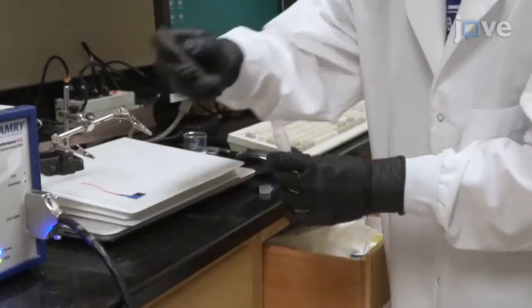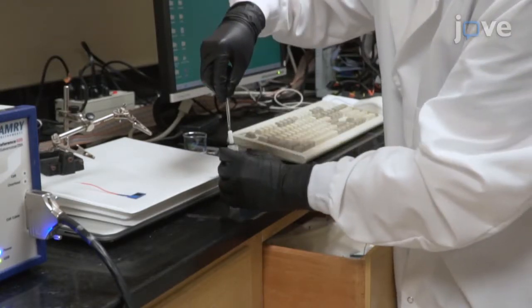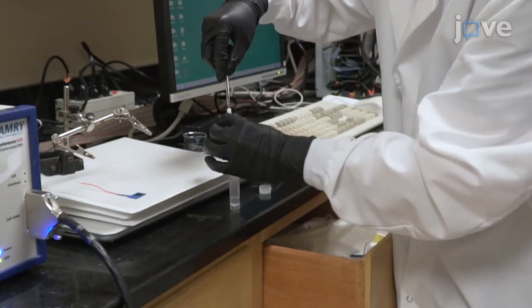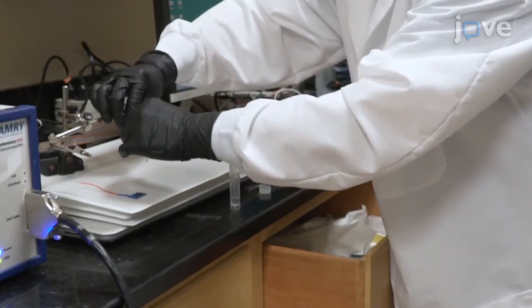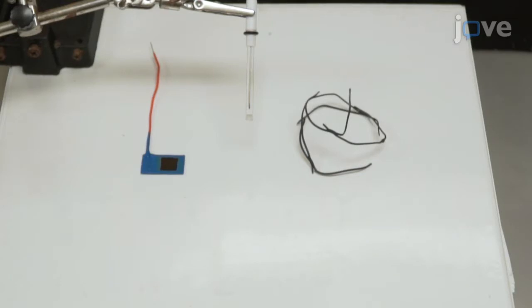To perform a tribo-corrosion test, collect the prepared aluminum sample, a standard silver-silver chloride electrode, and an activated titanium mesh for use as the working, reference, and counter-electrodes respectively.